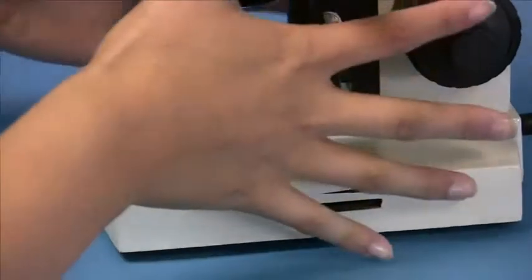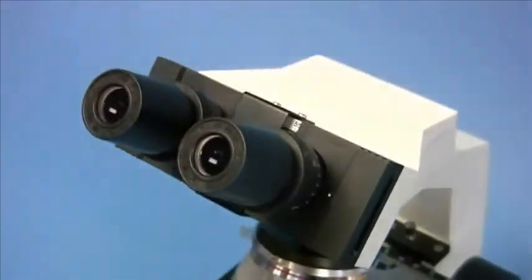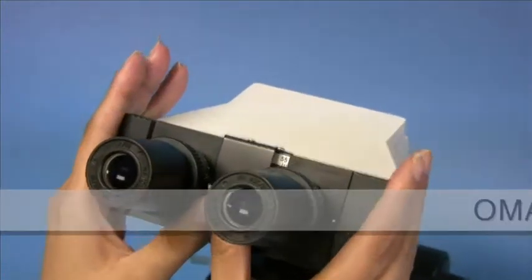Now, on top of these special features, the model is also designed to be adaptable to each user's specific needs. Next, starting with the sliding interpupillary distance adjustment.